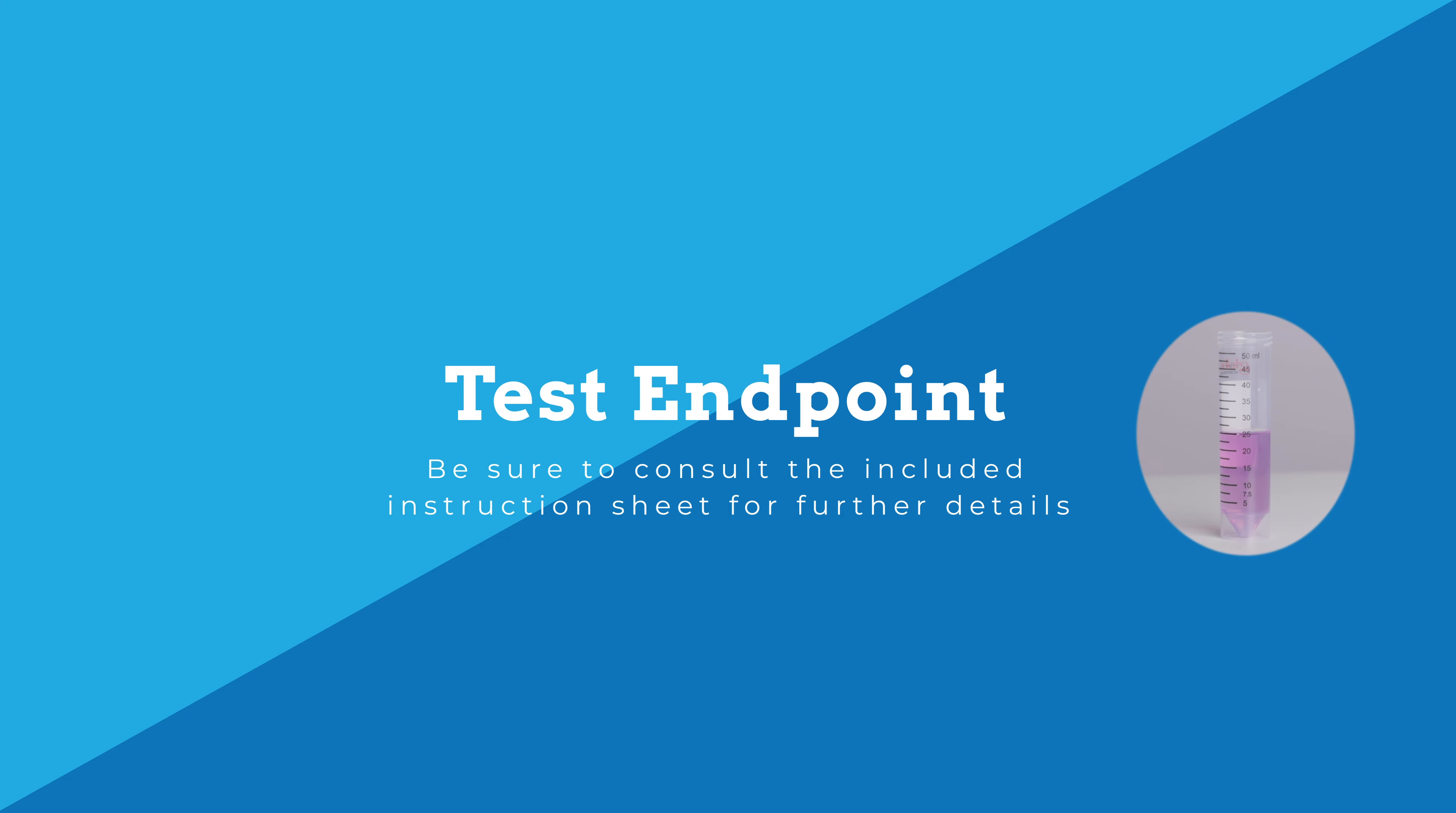This is a test endpoint. Be sure to consult the included instructions sheet for further details. Take care.